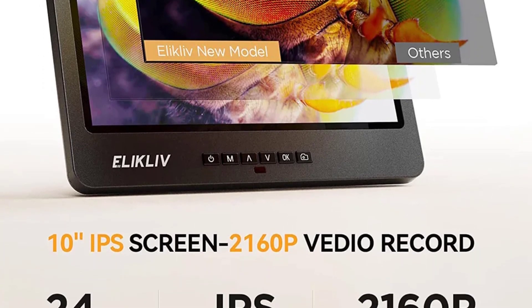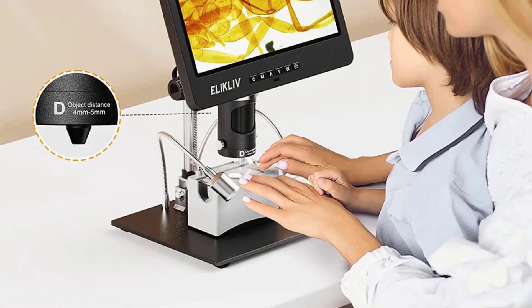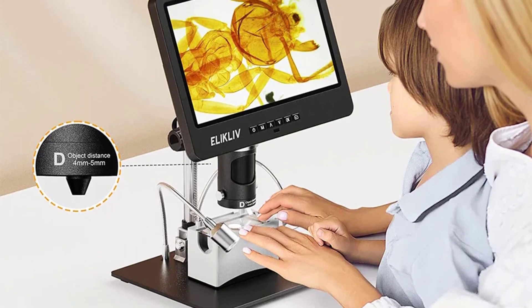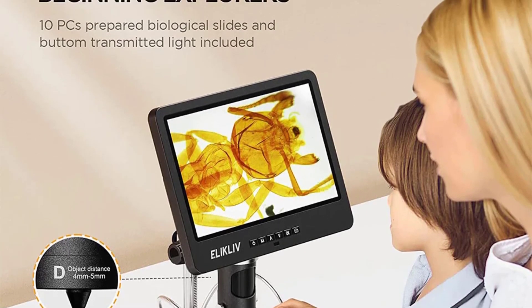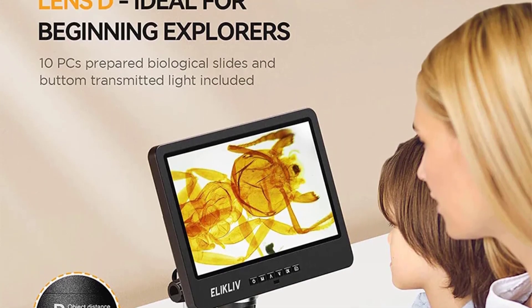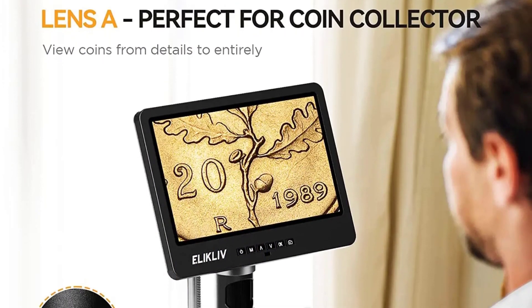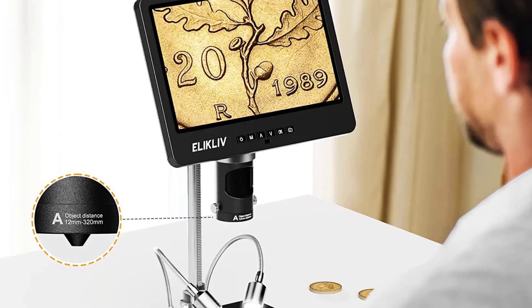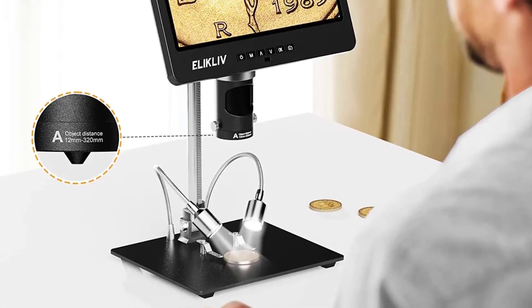The LED light source illuminates specimens effectively, and the microscope's ability to capture both photos and videos adds a layer of versatility to your scientific endeavors. The magnification range of 1500x to 3000x is impressive, allowing users to explore intricate details not visible to the naked eye. Whether you're examining coins, delving into the world of biology, or engaging in intricate soldering work, the EDM-602 offers the magnification needed for diverse applications.